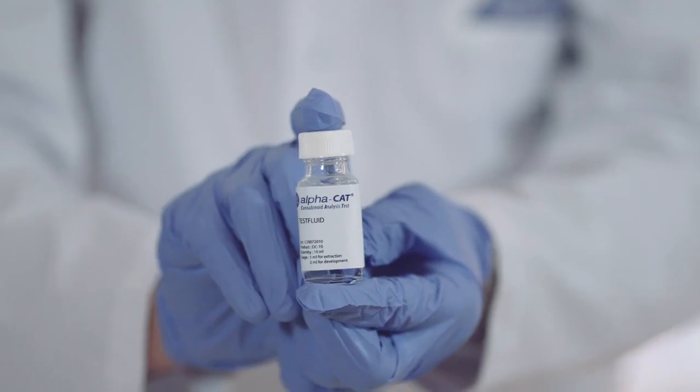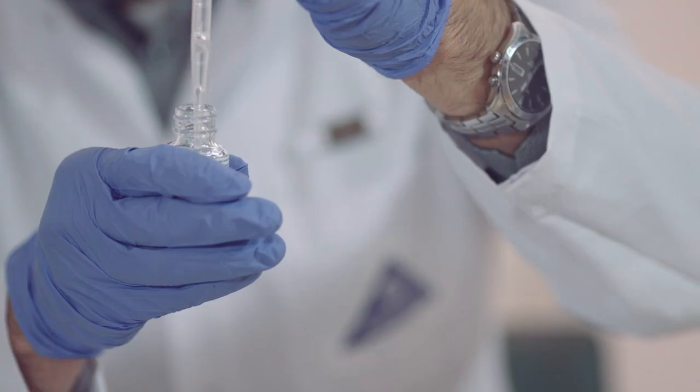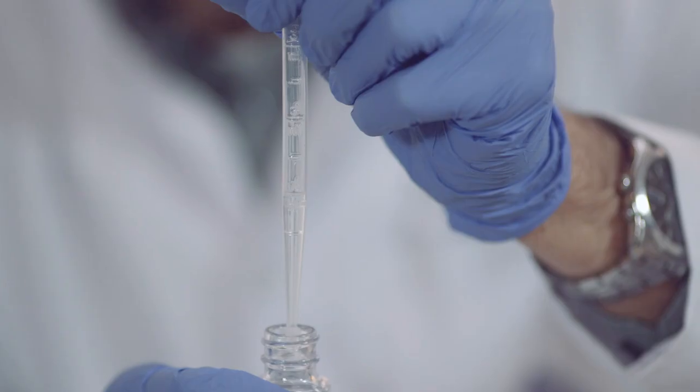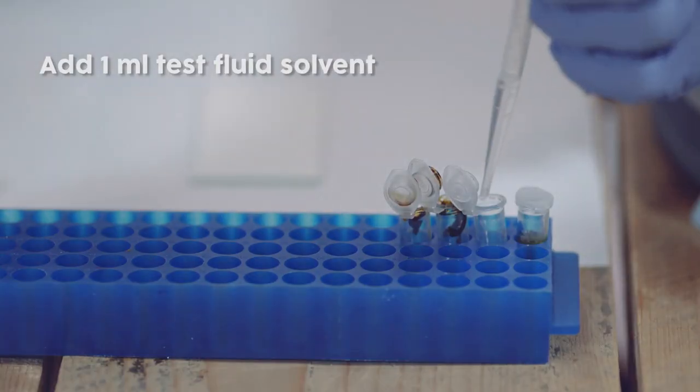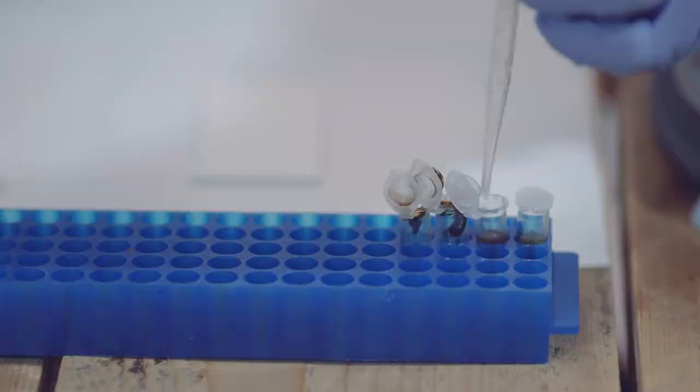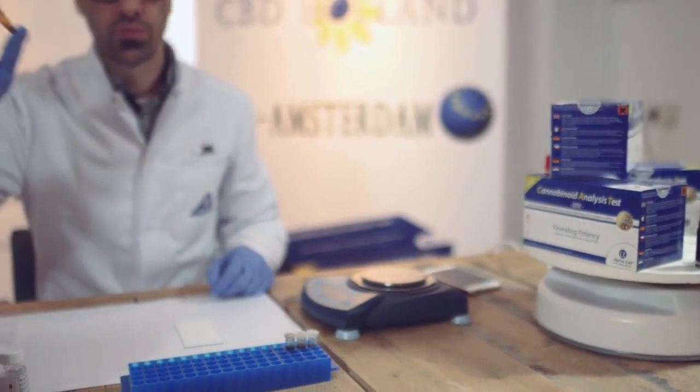After you have taken the test fluid and pipette out of the package, collect one milliliter of this fluid with the pipette and add it to the extraction tube. Quickly close the lid of the extraction tube and shake vigorously for 10 seconds.